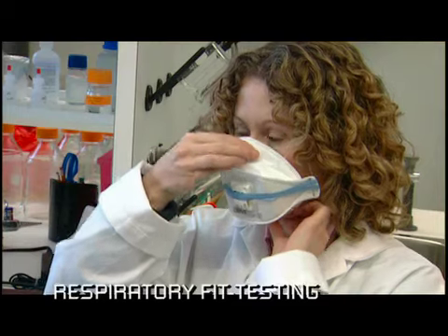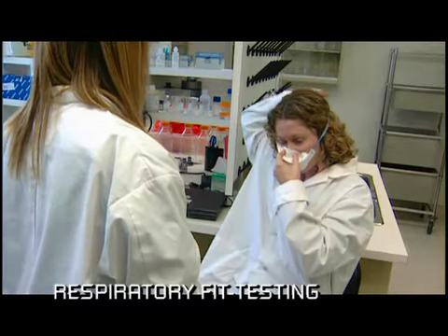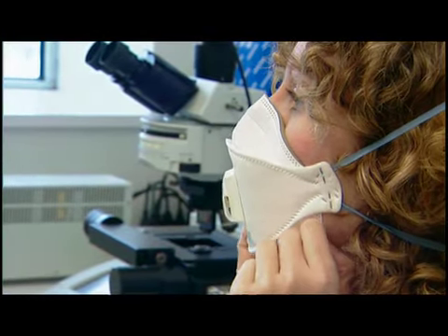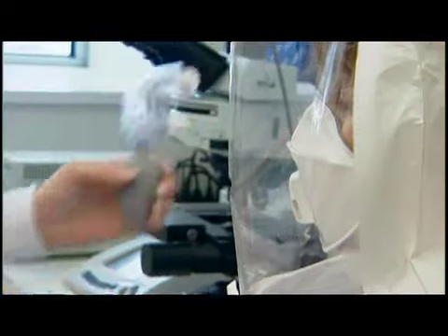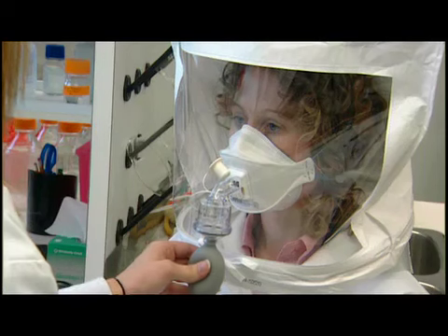A word about your respirator. This is your most important piece of personal protective equipment. It has to fit you. You must be fit tested prior to working in a facility to ensure appropriate respiratory selection and use. To be effective, respirators must provide a proper sealing surface on the wearer's face.